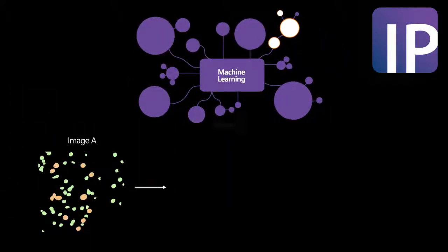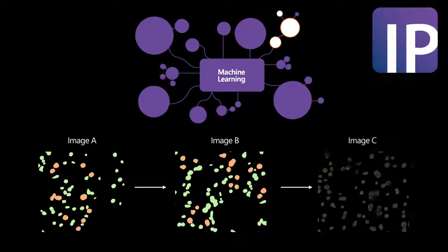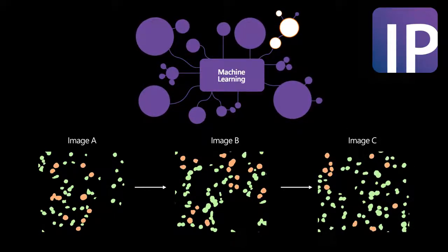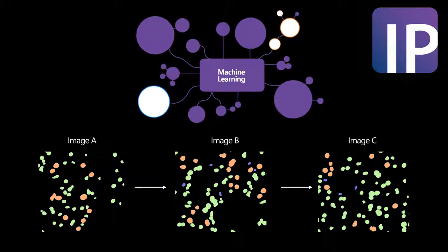The highly flexible nature of Smart Segmentation allows for adjustment between images in a set. As some structures may not be ubiquitous throughout the sample, one image may not be representative of the whole experiment. Smart Segmentation may be updated or adjusted with new inputs that are refined from additional images to correctly analyze the entire set.